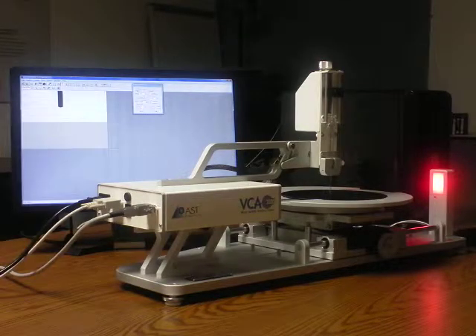This is the VCA 3000S. This is used for measuring contact angle on wafers. It has a 12-inch diameter stage. It has the same software as the VCA Optima XE.